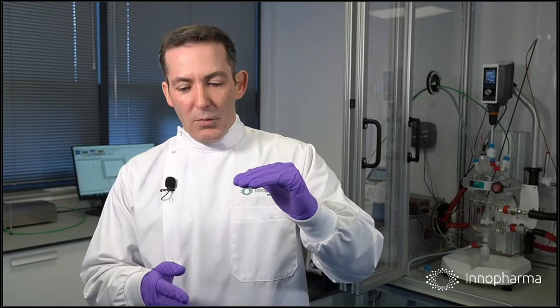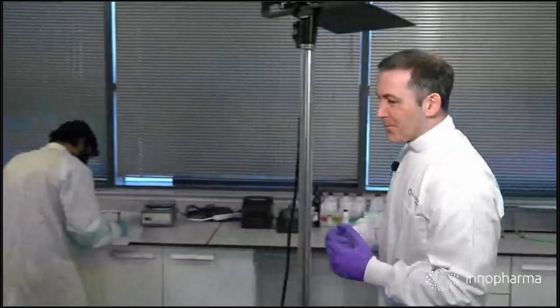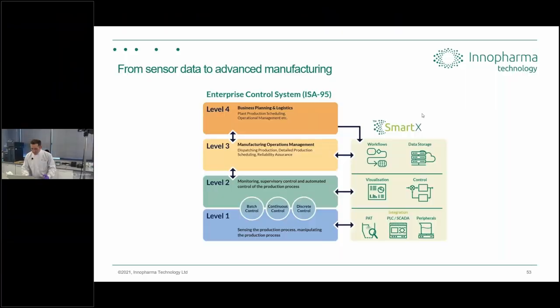All right. So while Kieran is going through the process of weighing, I'm going to take you through what we've discussed today, the methods that we've applied today, to get us from the sensor and signal level to the level of monitoring for control. But what I want to talk about next is the steps toward control. And in fact, not just control, but as I mentioned, supervision, where we use the monitoring and control of the current experiment by comparing it to previous experiments, an ideal reaction or process development. So I want to switch back now to the presentation again. So if I share my slides one more time.